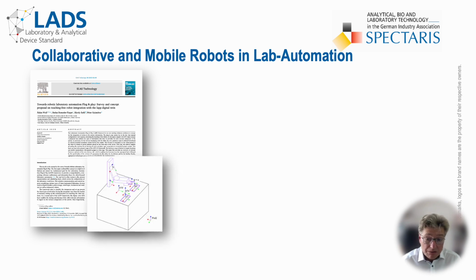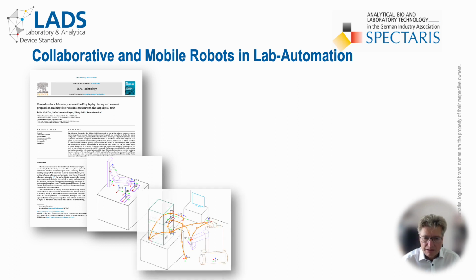Some illustrative images from one of his publications. A cobot on a laboratory bench transferring plates. A mobile robot performing pick, transport and place throughout the laboratory.